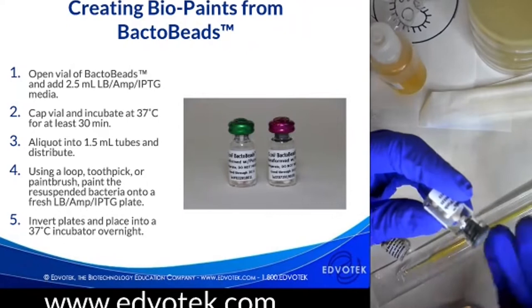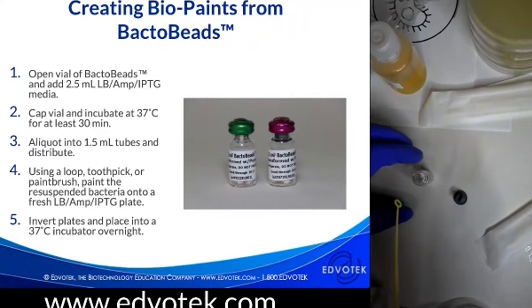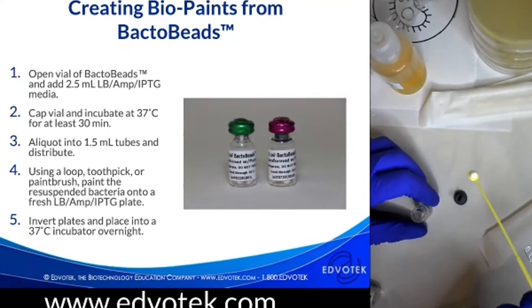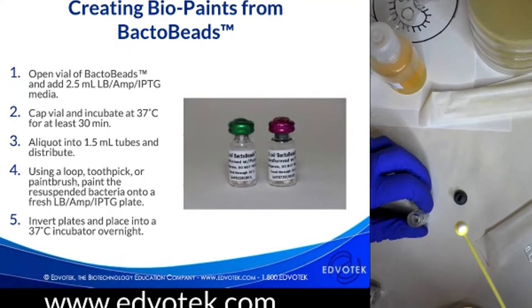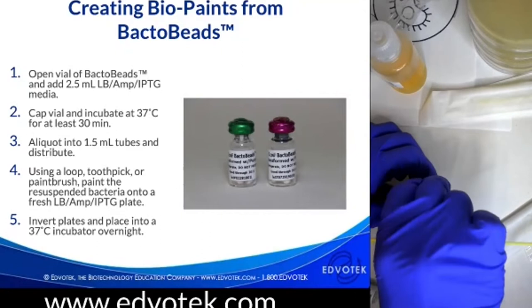Each of these beads, let me bring one out for you so that you can see it, is going to contain microorganisms, buffer, salt, and the nutrient broth necessary to sustain them in this freeze-dried state. You can see here, it's a little pellet. If you're familiar with the ice cream Dippin' Dots, they're about the same size and consistency. Because they are freeze-dried, each of them contains millions of bacteria pre-transformed with our plasmid. And these are great because they're ready to go when you're ready to do the experiment.